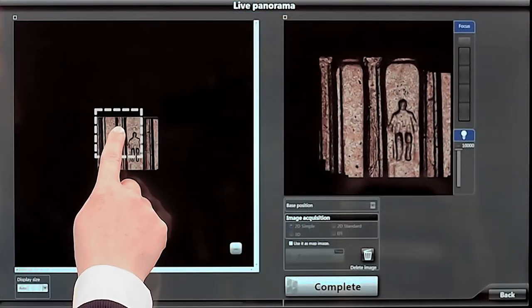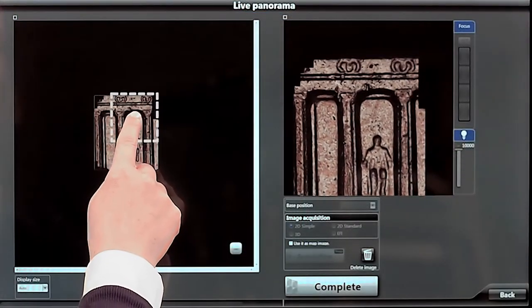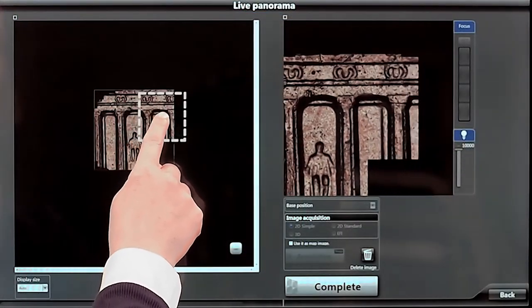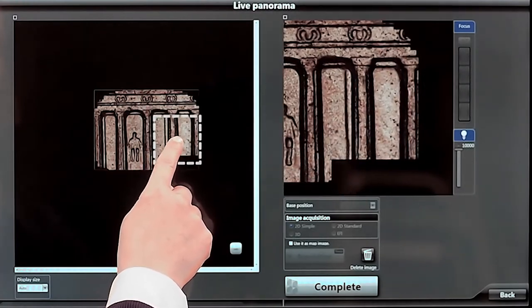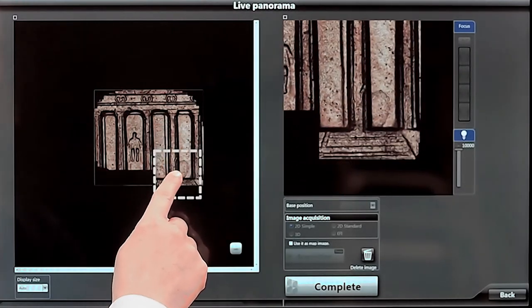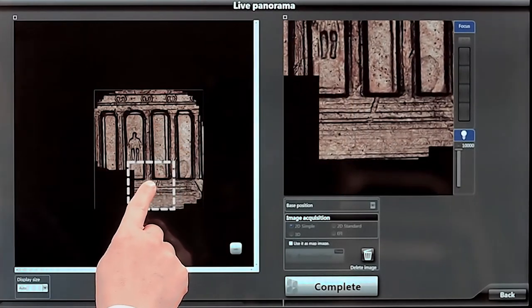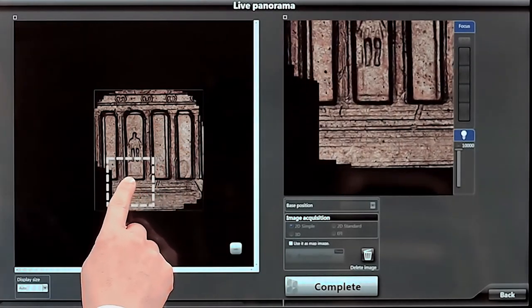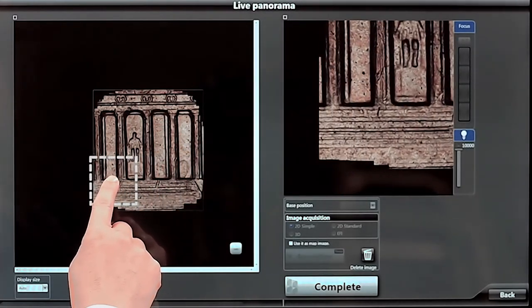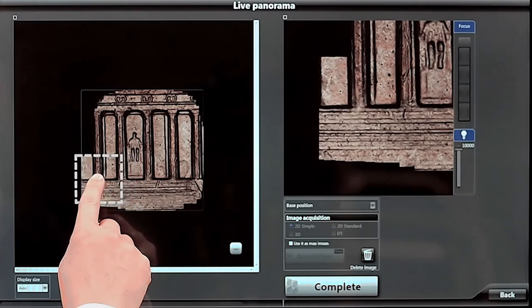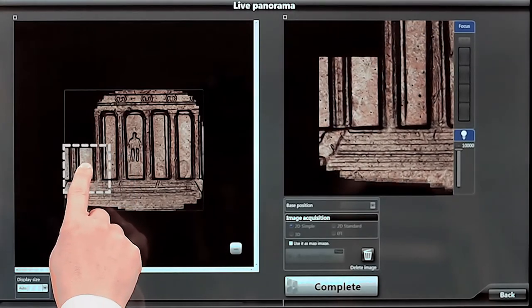And if your sample is too large for the field of view, the remarkable panorama mode seamlessly stitches together multiple images as you just move your finger around the screen.